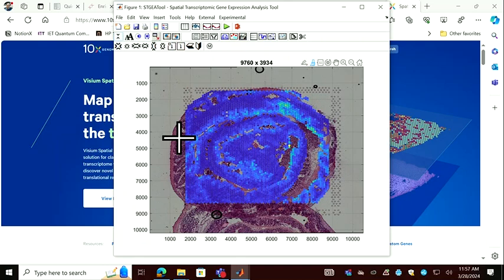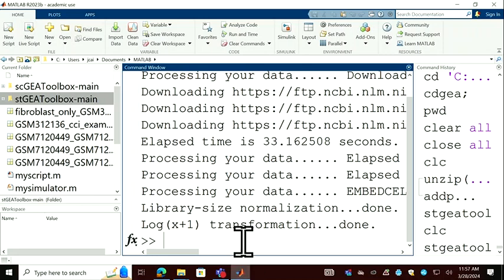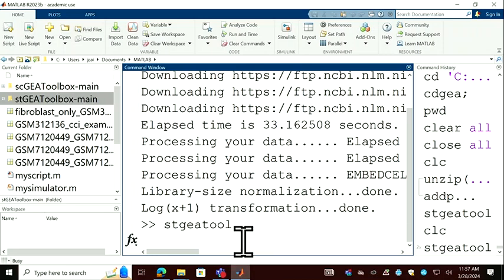Oh, you mean lasso, the selection of the region. Yeah, what we can do is, if you want to select those spots, you can click with the shift key and select them.